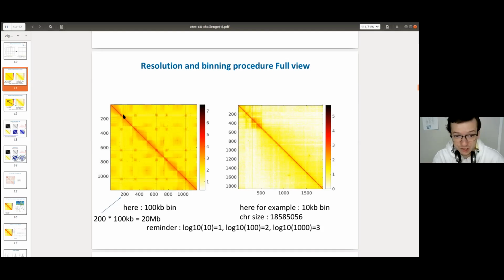On this species, each centromere interacts with each other. That's why you see here the centromere of the chromosome 1 interact with chromosome 2, with chromosome 3, 4, and 5. And that makes the pattern here.